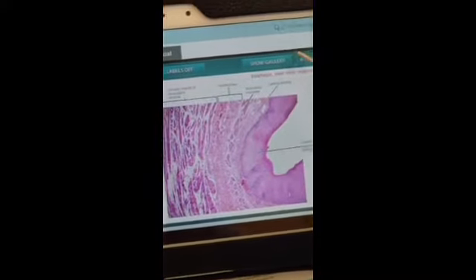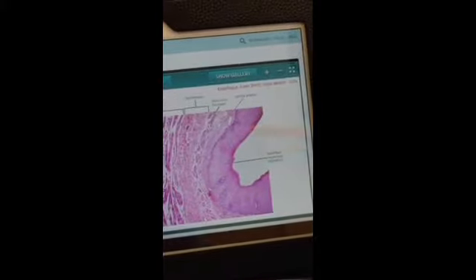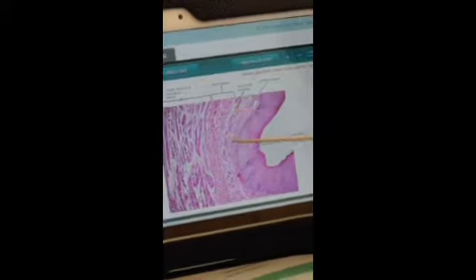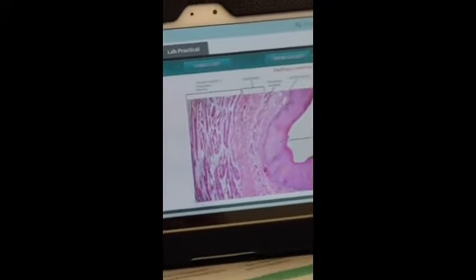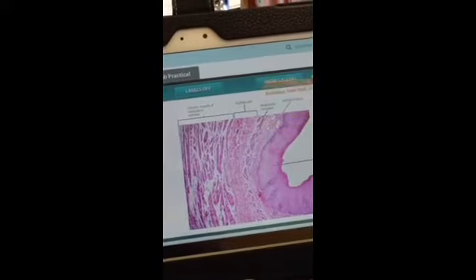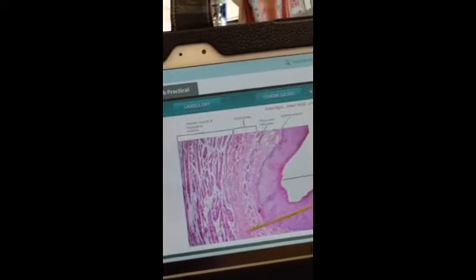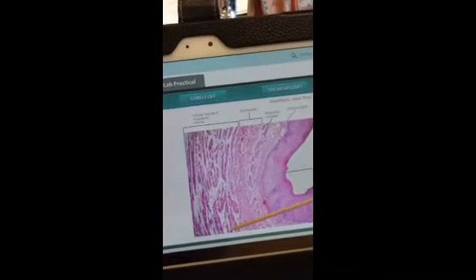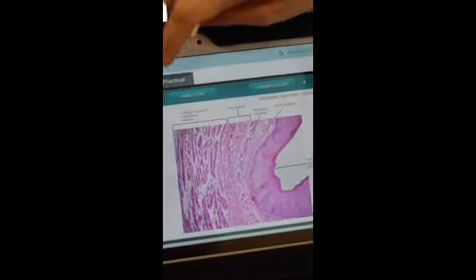This is pretty similar. You have your epithelium, lamina propria, and the muscularis mucosa. This is all the mucosa layer. These three layers are the mucosa, then the submucosa, the areolar tissue, and then the circular muscle of the muscularis externa. Very good. And that's the esophagus.